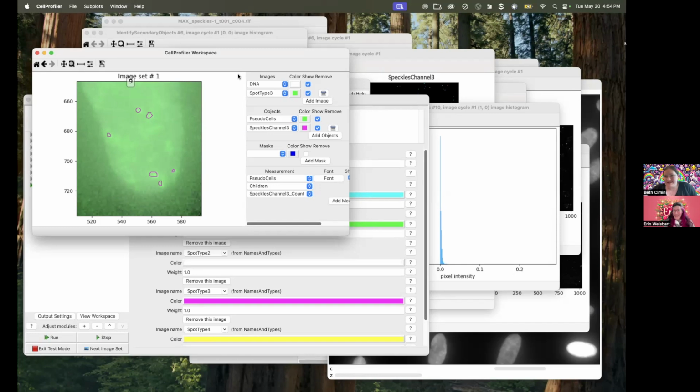Yay. Anything to add here, Erin? No, I think very sparkly. I happen to like workflows where you identify lots of objects, especially the outlines, because you can give each of them a different color. I had a workflow where someone basically told me it was too psychedelic. You couldn't interpret any of my object outlines because there were too many objects and too many colors. You'd never guess that that was a thing I liked. But again, a handy thing to remember is that it can be really helpful for interpreting after the fact what your outputs are and what you're seeing.